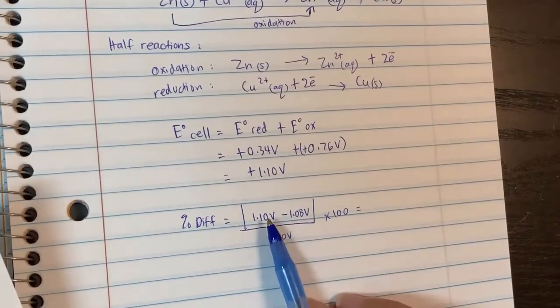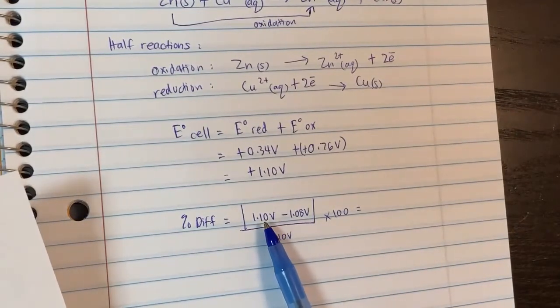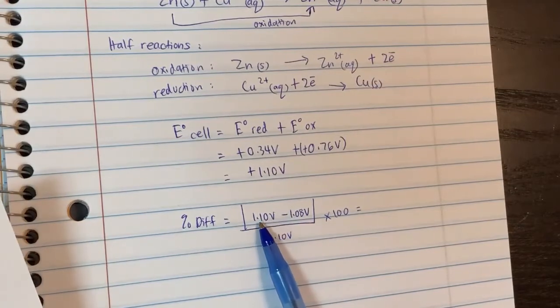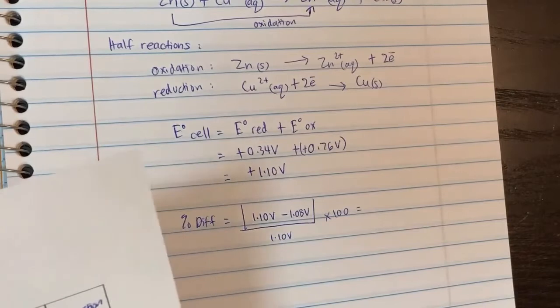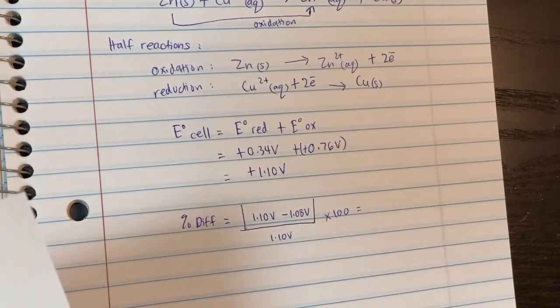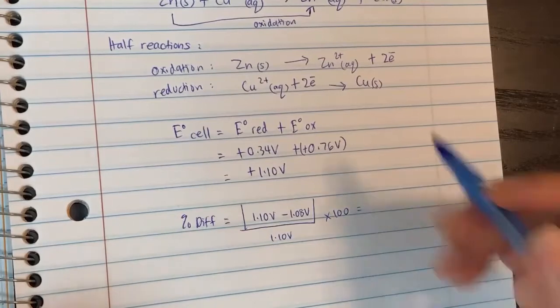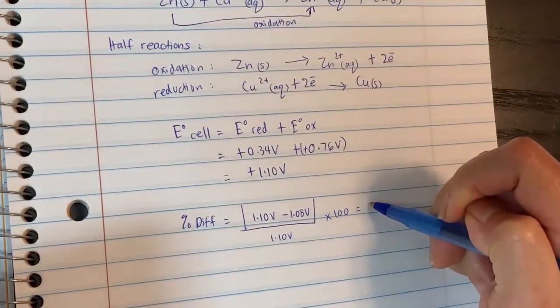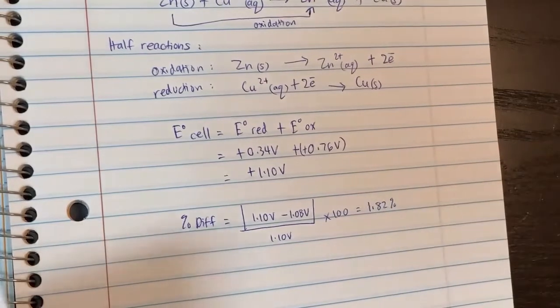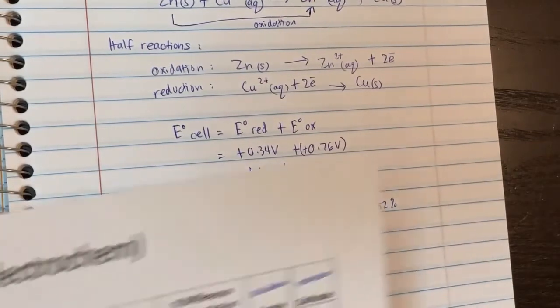I know that sometimes they ask you for the difference, but I think the quiz actually asks you for the percent difference. So 1.10 minus 1.08 is the difference. You should get 0.02 over there, and then you divide by 1.10 and times 100 to get the percentage, which in this case is 1.82%. Okay, so you would put that here.